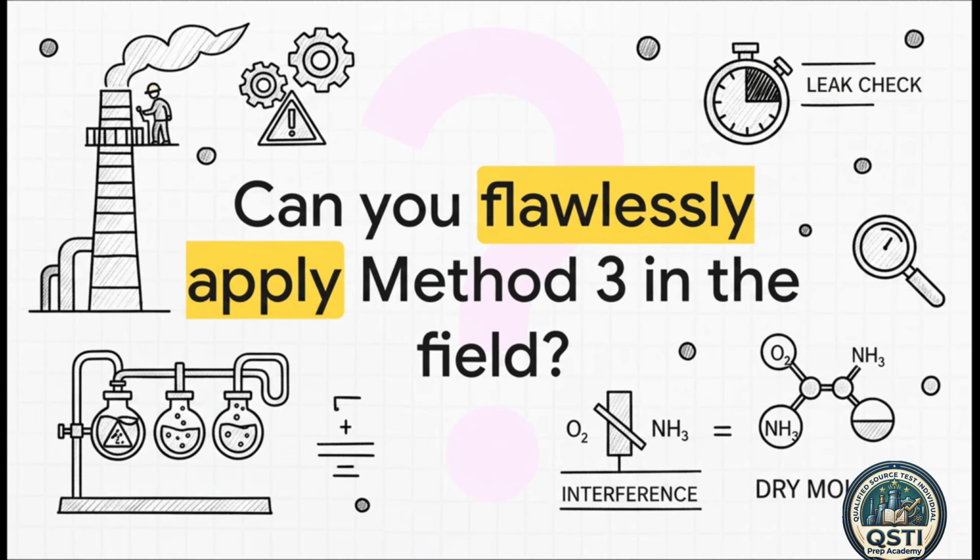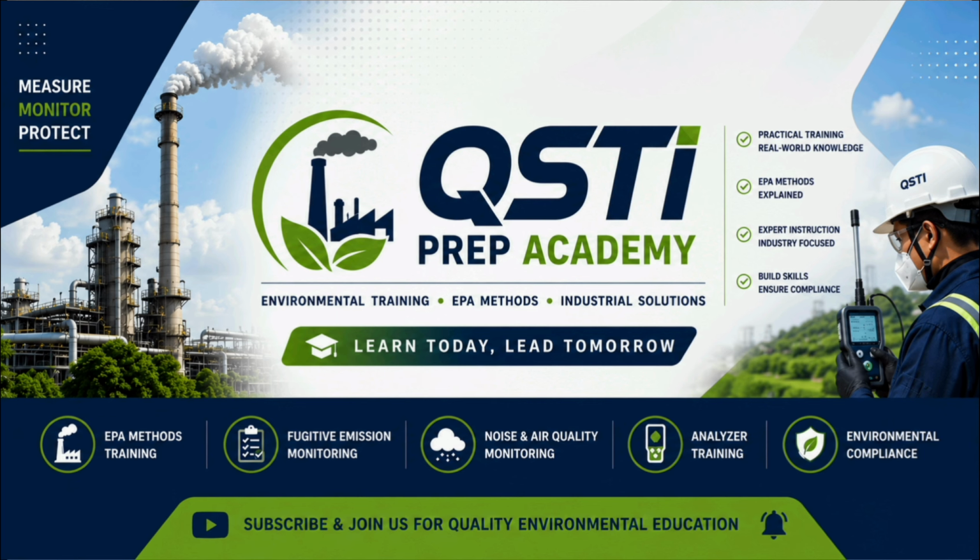So, we've covered the entire procedure today, from setting up your grab train to respecting those highly corrosive reagents, verifying your 8-hour windows, passing that strict 4-minute leak check, all the way to finally calculating your dry molecular weight. My final question to you is this. Are you prepared to step out onto a real stack and apply Method 3 flawlessly, without letting a hidden interference like ammonia completely ruin your O2 readings? Study these slides, know the standards inside and out, and I'll see you out in the field.